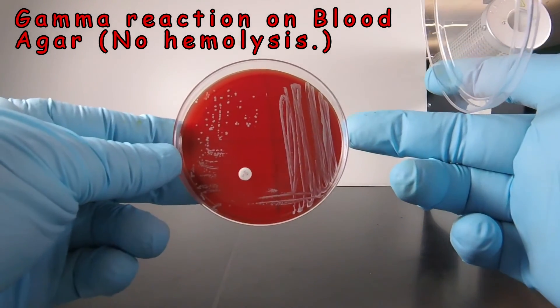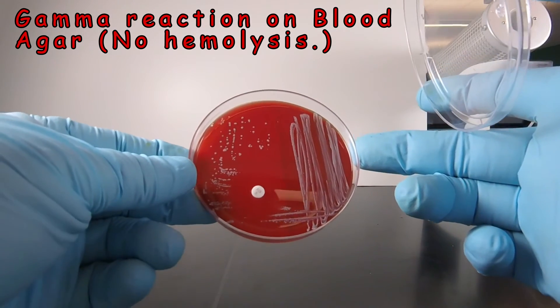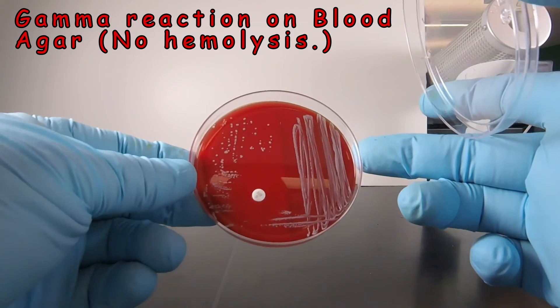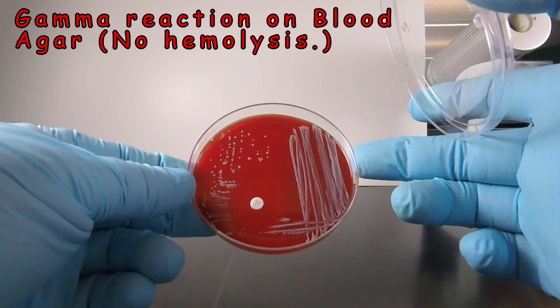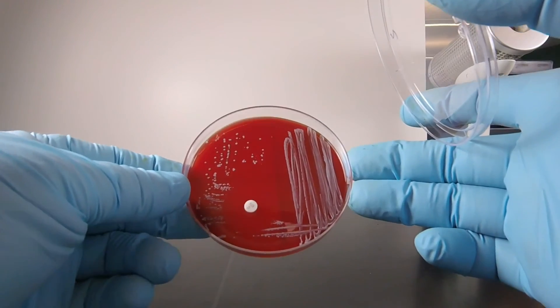Notice that the agar still looks like blood agar. There's no green or brown discoloration around the agar like we see in alpha. There's no lysis of the red blood cells. It just looks like colonies growing on blood agar, where the blood agar still looks red and opaque. So that's a gamma reaction on blood agar.